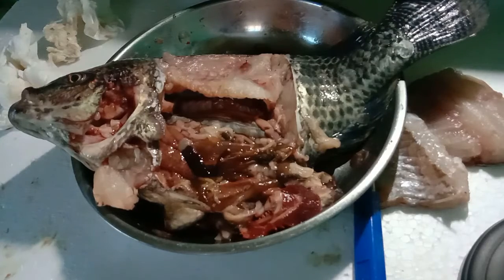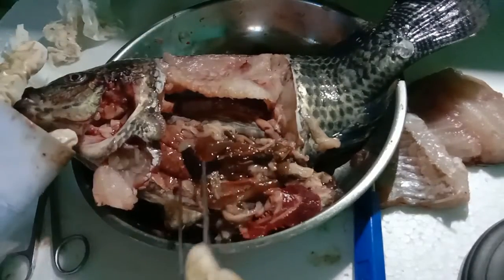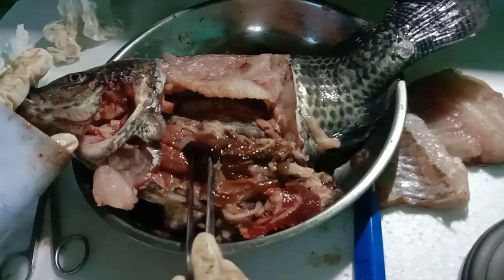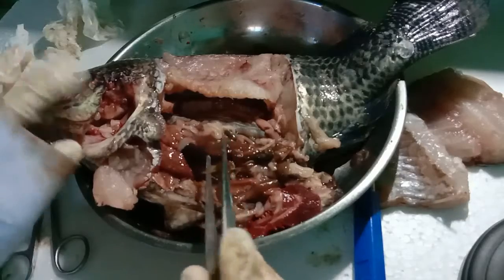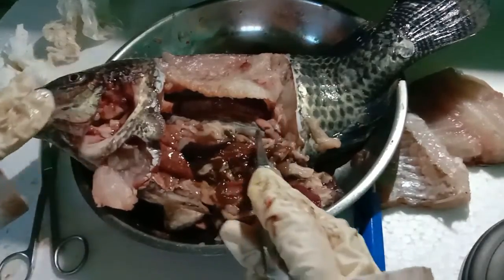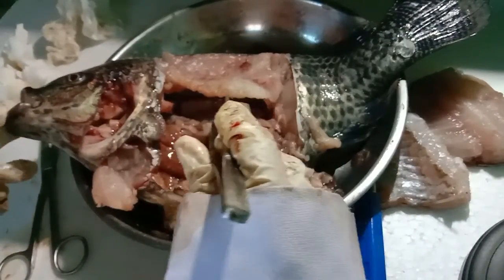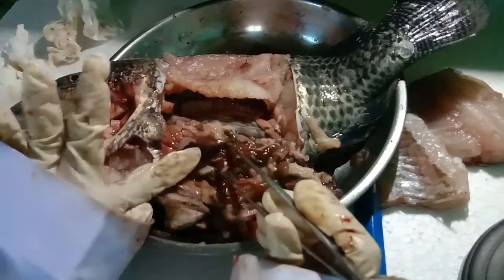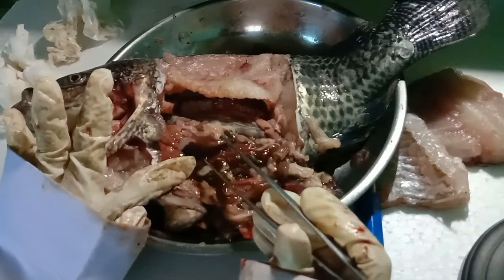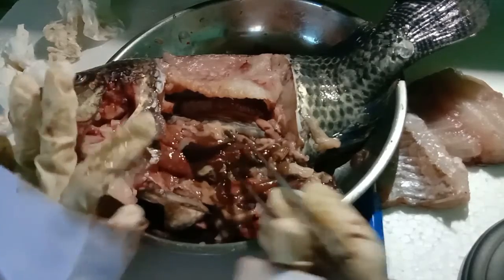Fifth discussion is about the circulatory system. We can see the dark color organ here. Very dark color organ here. It's the spleen. It acts primarily as a blood filter and plays important roles in regards to red blood cells and the immune system.